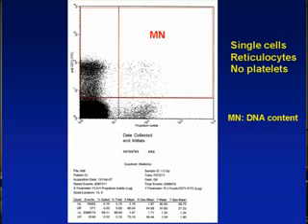Then if you look at the numbers here, these numbers can be divided into 4 quadrants: upper left, upper right. Those are the reticulocytes. So the total number of reticulocytes will be that number plus that number. And then the micronucleated reticulocytes will be 571. So if you divide the 571 by the sum of these two, that will be the percentage of micronuclei you have.